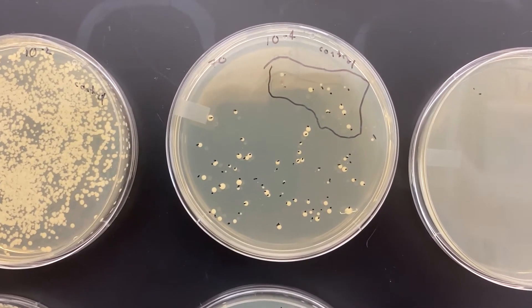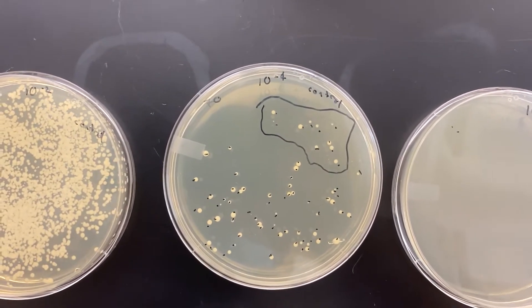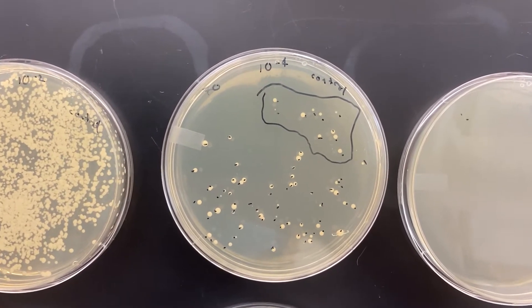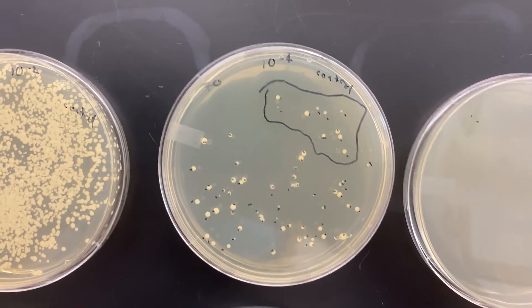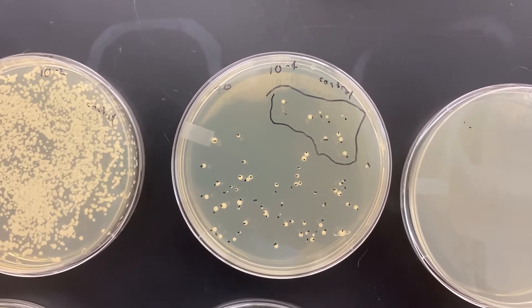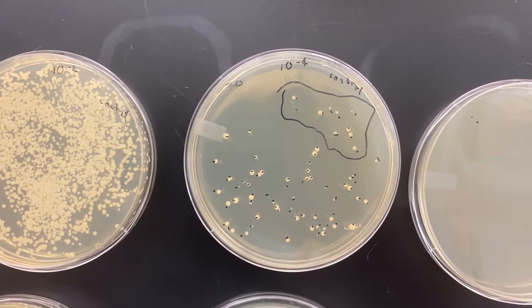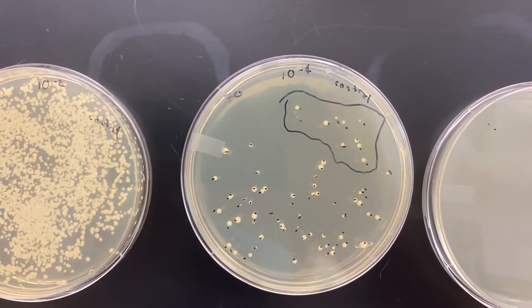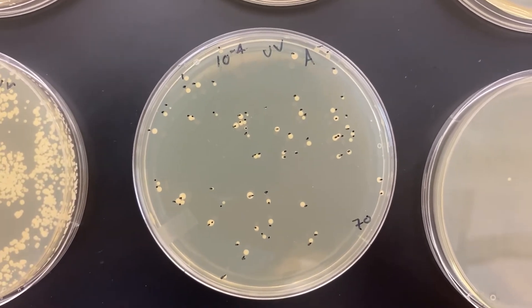Let's compare the number of colonies that I counted — I wrote them on here, and you probably also want to make a note in your notebook. This one I got 70 colonies growing; this is the control, so no UV treatment, 10 to the minus 4 dilution. I plated the same cells from the same solution onto these plates, so presumably I plated about the same number of cells. Let's see if that was the case: 70 here, 70 there — I swear I didn't make this up.